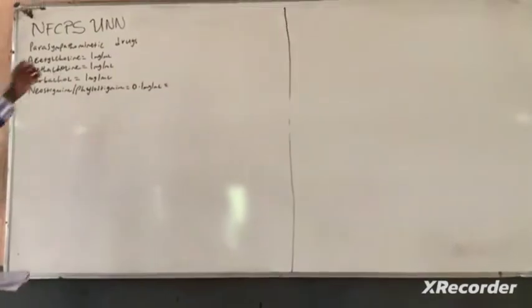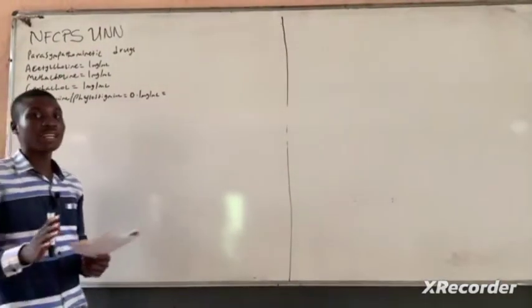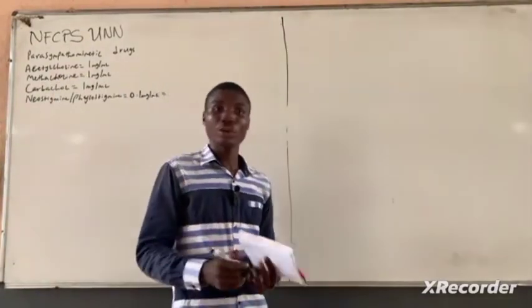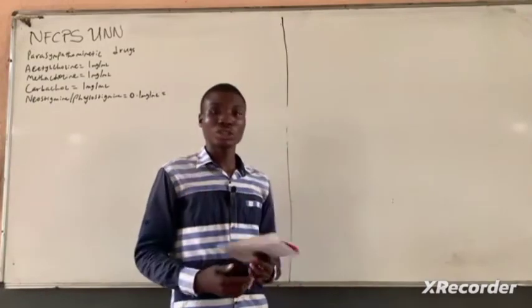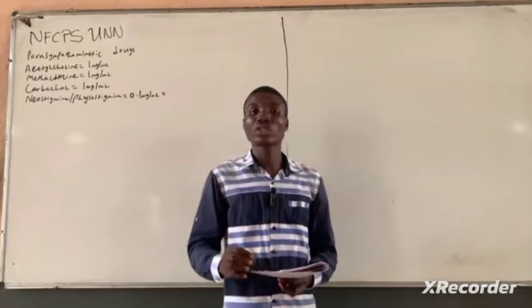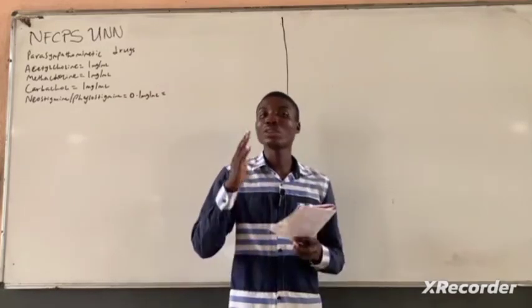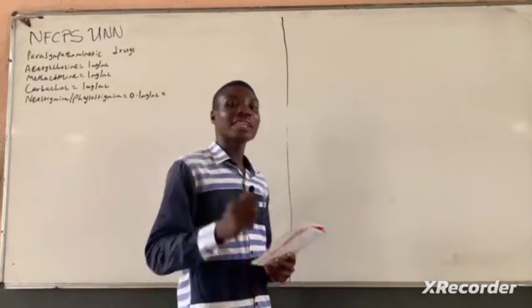So we are working with some concentrations. We have acetylcholine. In the laboratory, you can be given any concentration that the technicians deem fit for you. And in your alternative to practical, they can give you any concentration. But what you need to know is how to work around the different concentrations and be able to get exactly what you need or desire from your experiment and get the right results.